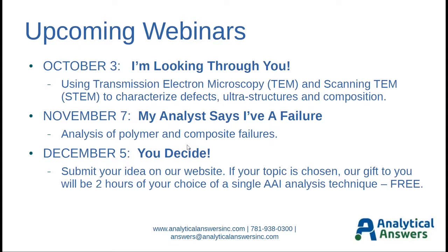So we do have that capability. I just didn't show any of that high kV work in this webinar. However, next month's webinar is going to cover all of that, where we talk about TEM and STEM.